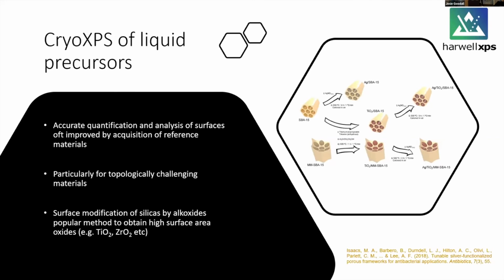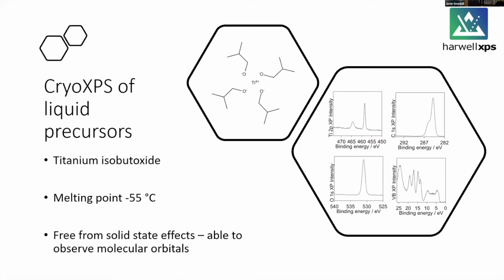Modification of high-surface-area materials gives you something interesting: it allows you to combine a high-surface-area material with a good support. One way to do this is by wet chemical methods. But in order to understand what kind of layers we're building up, referencing is pretty important.